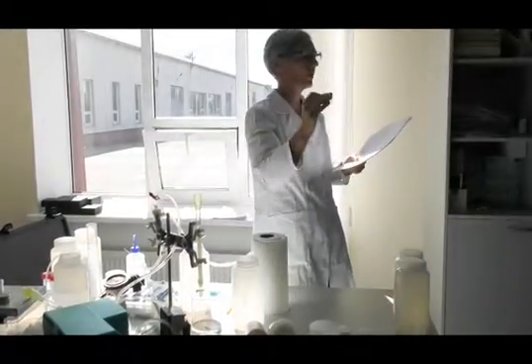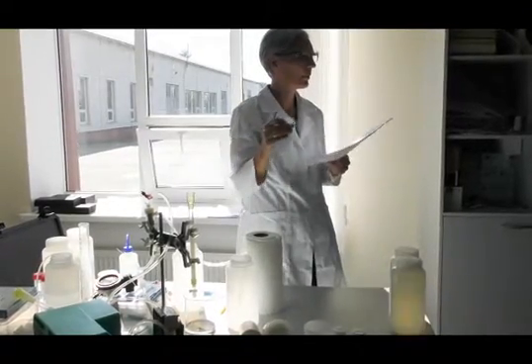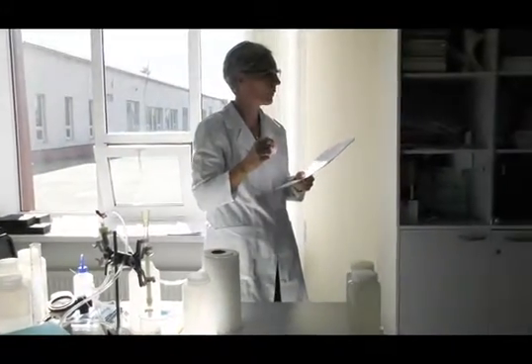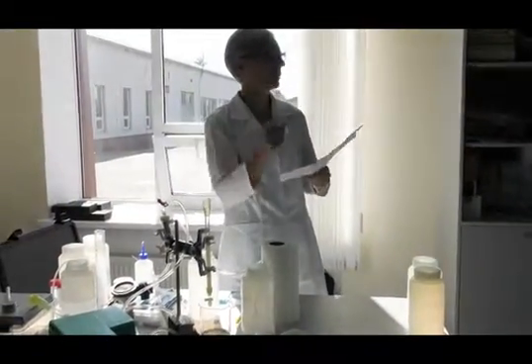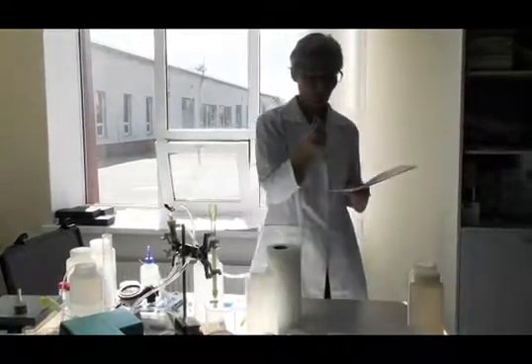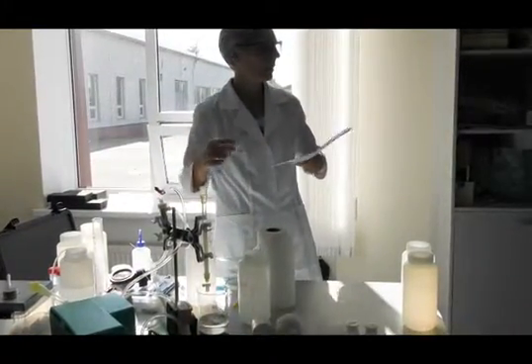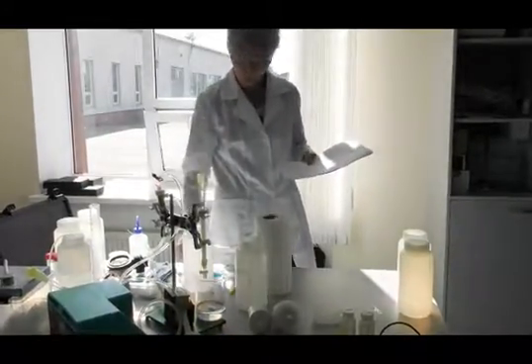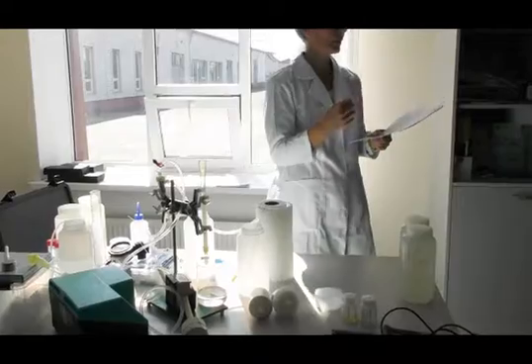It's just to remove big particles that have nothing to do with radionuclides. If it's plant parts or small stones in the sample or whatever, we don't want that in the sample. We don't want that in our instruments. But it has nothing to do with radionuclides or particles or something. So we prefer to use this just to protect the other filters and the instrumentation later. Yeah, so it's just a pre-filter. But this is the 0.45, or these others, to remove the particles from the water sample.